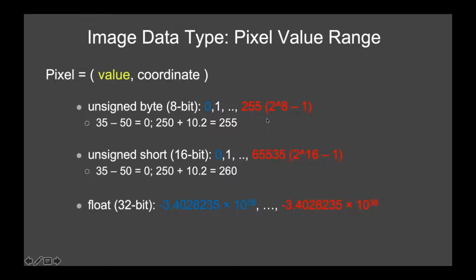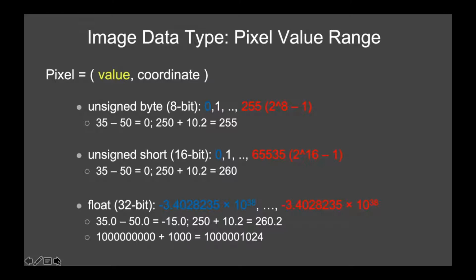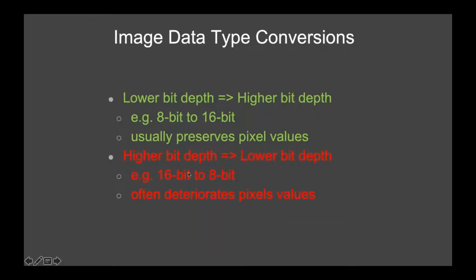Okay. Our next question is, for image analysis, should we convert a 16-bit image to 8-bit, or should we not do it because it loses depth? I think you should not do it because it loses not only depth, but the problem is if you go from 16 to 8-bit, you also have to make some decisions. For example, in your 16-bit image, you might have a value of 3,500, but you need to have something that's 255 or lower. So there has to be some mathematical formula.